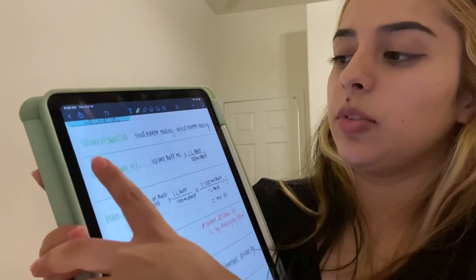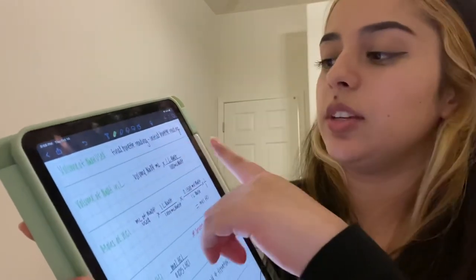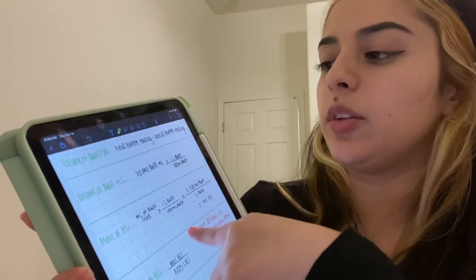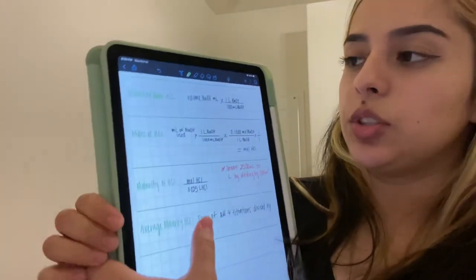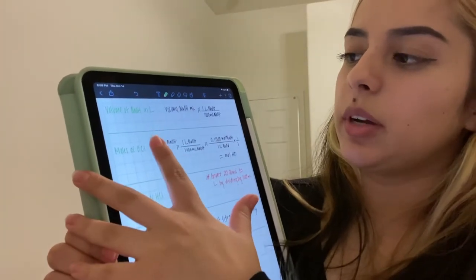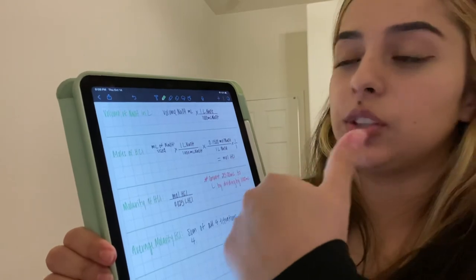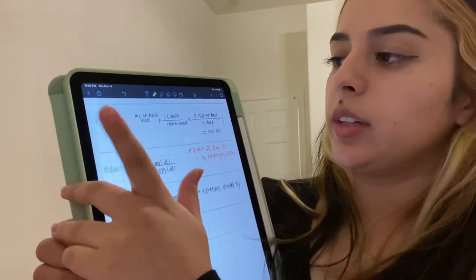Record the volume of the base used and record the endpoint color. To calculate the volume of the sodium hydroxide used, subtract the initial burette reading from the final burette reading. You will also need to convert the volume of the sodium hydroxide into liters, since it is in milliliters.